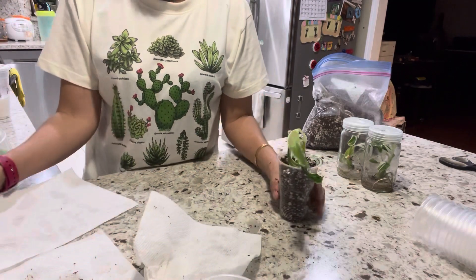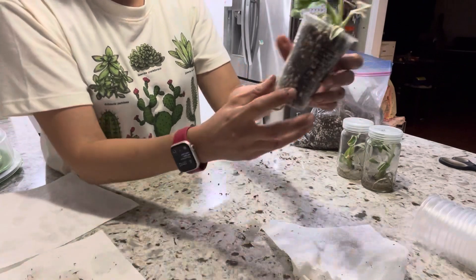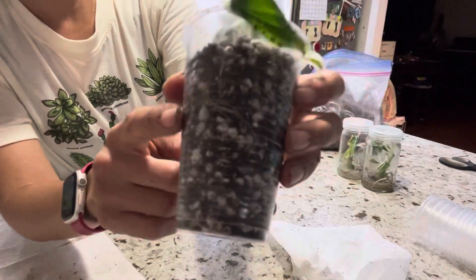This is another pot I mixed earlier. The most important thing is to see the rooting, because just after deflasking it takes time to adjust to the soil.